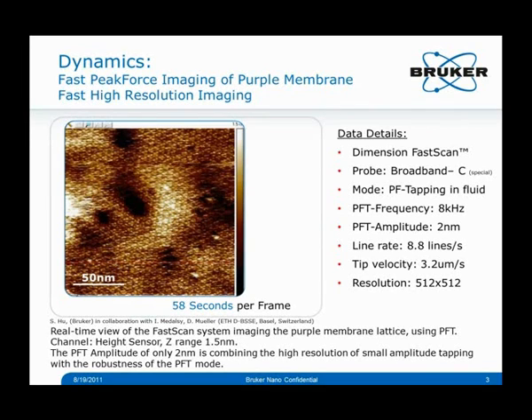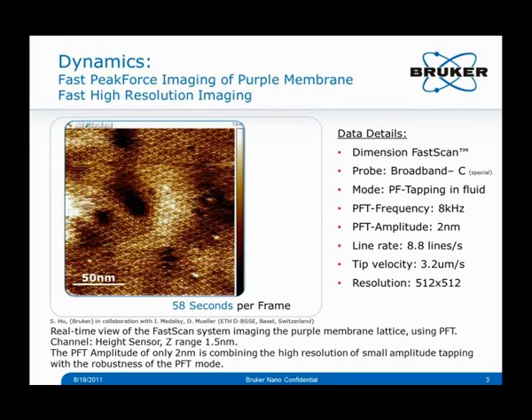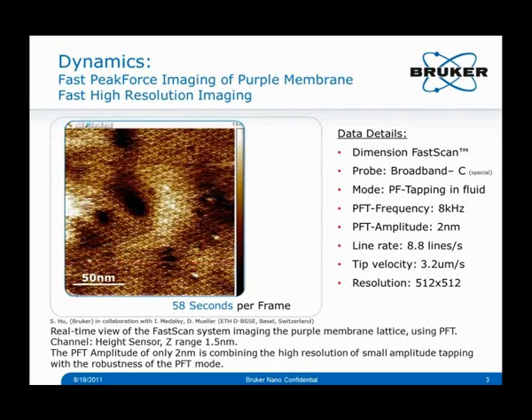In ContactMode, the force is represented by the deflection of the cantilever, with the assumption that the zero deflection adjusted once in the beginning is going to hold up. However, a soft cantilever is also a bimetallic strip, so this zero force will drift and therefore the imaging force will drift. And so it is very hard to maintain a stable imaging condition over one or even several images in contact mode.